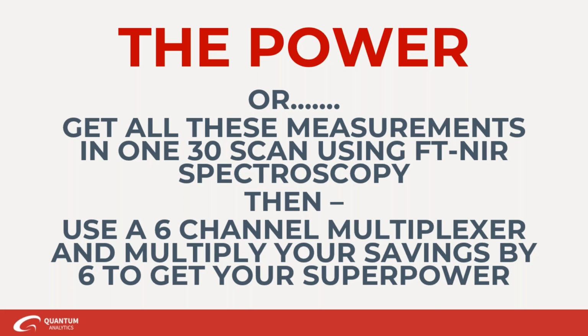Sometimes you can just tell by looking at the spectra if it looks all goofy, the signal's way lower, or way higher. Some of it's saturated the detector or whatever. So there is a sort of a science and a technique to it. But what you definitely don't want to do is see outliers that the math shows and just pull them all out, because even though it may make the statistics look better, in practice it may not work as well.